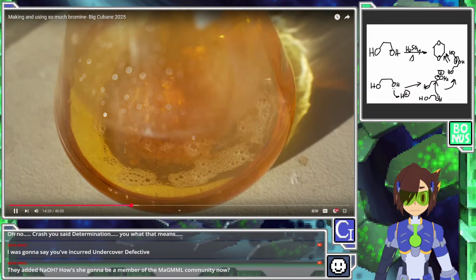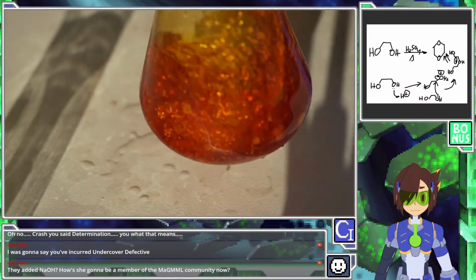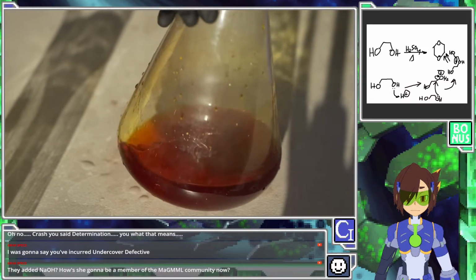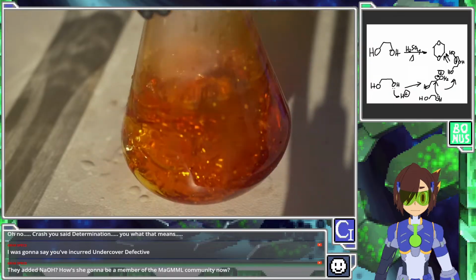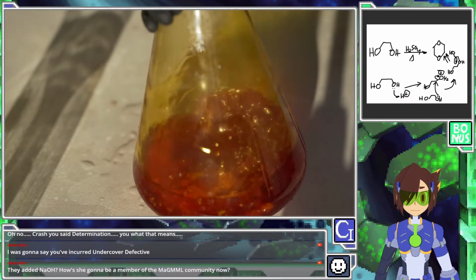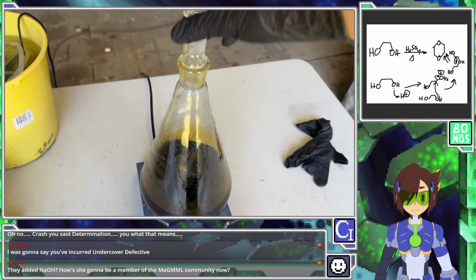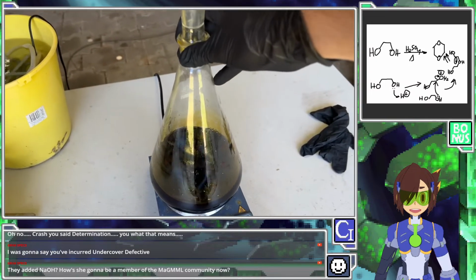I remember adding the hydroxide previously, and it goes a little red or something like that, but it's never gone this black color. But that's usually because we throw away most of the acetaldehyde, which is a byproduct of this. So we throw that away in a distillation first before adding the hydroxide. I don't know. The dark stain should be fine. Light brown is kind of oddly delicious. It's kind of Dr. Pepper looking though.